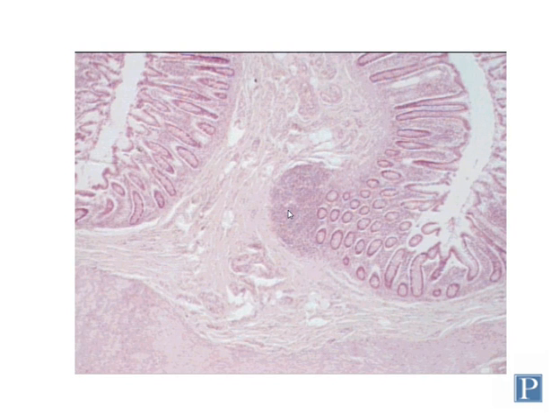The lymphoid system is really arranged in two ways. You have a lot of lymphoid cells, B and T lymphocytes, that are arranged throughout the body in tissues that are embedded in other organs. This is sometimes referred to as the diffuse lymphoid system because of their diffuse organization throughout the body. The other part of the lymphoid system is organized into discrete lymphoid organs, in which you also have B cells and T cells and other cells. So we're going to look at both diffuse lymphoid structures and lymphoid organs.